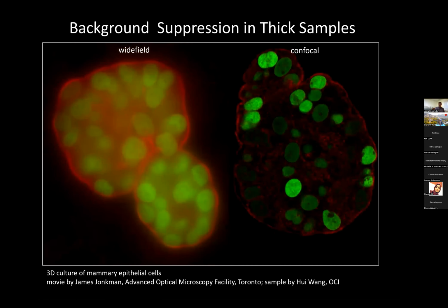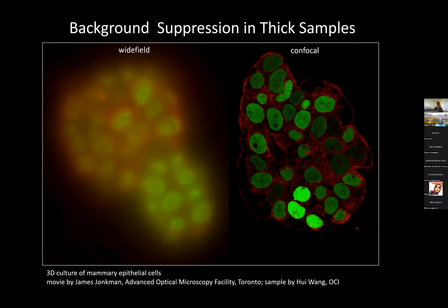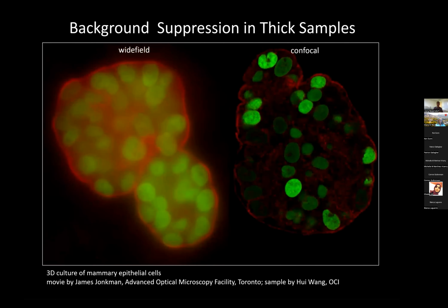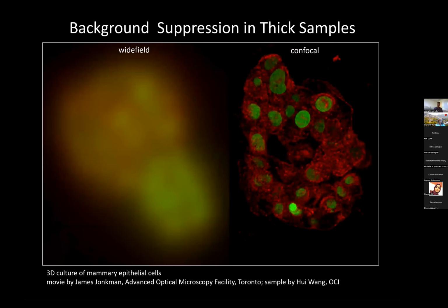So this is the motivation why you want to use a confocal microscope in your research. Anytime you image samples which are thicker than a few microns, if you really want to look at small, subtle details, the confocal microscope is a good choice.